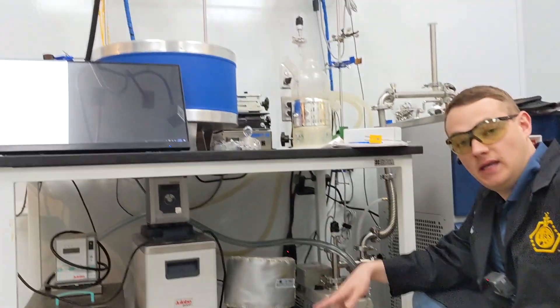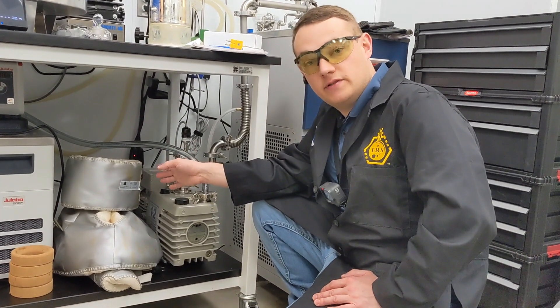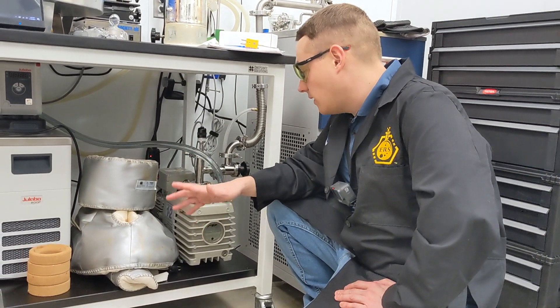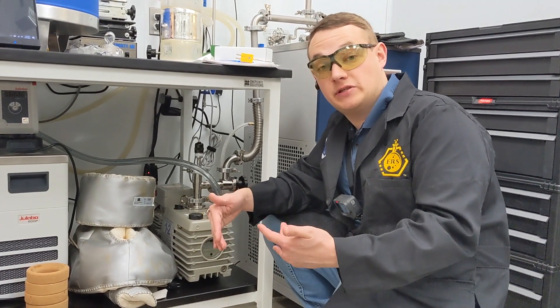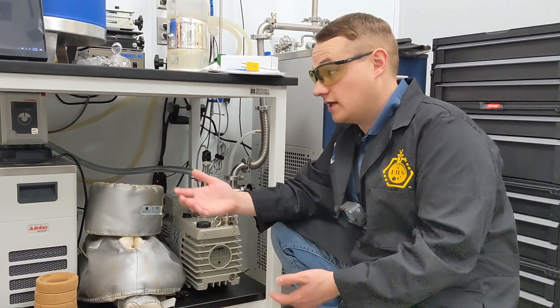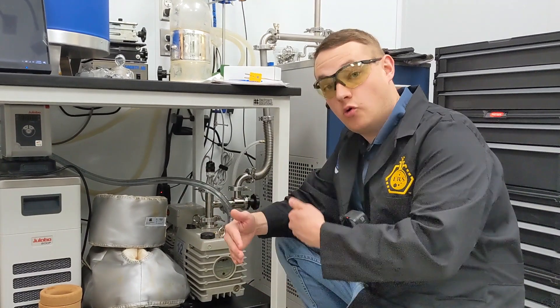We use these on our benchtop SPD systems and thin film systems — they're used on an array of different types of distillation systems and they work great. Our advanced pump exchange program mitigates the downtime associated with rotary vane pumps, because when the pump breaks you're not going to be able to do distillation. Either having a backup or being able to quickly replace the pumping module is key, so keep an eye out for our advanced exchange program.